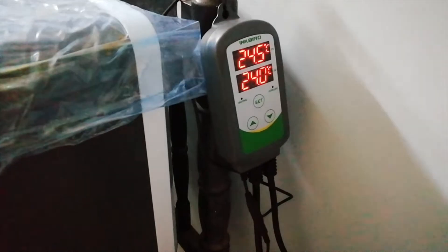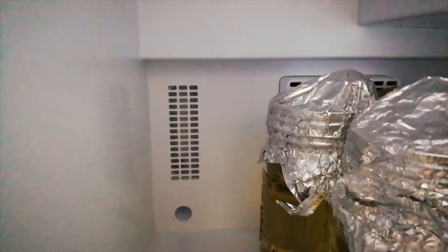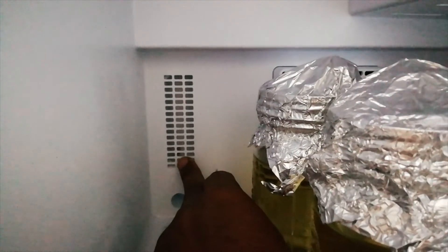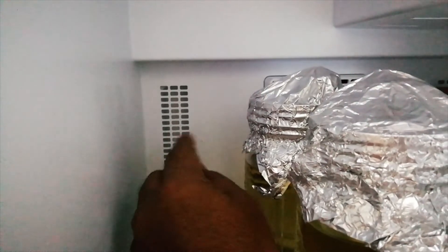The controller comes with a sensor. I will show you the parts. This sensor can be placed inside the fridge from the back. When you open the fridge, you can see the sensor behind. You open the backside and put the sensor from the inside. There is a small thermocole piece — you put a small hole, insert the sensor, and cover it with gum or something similar.